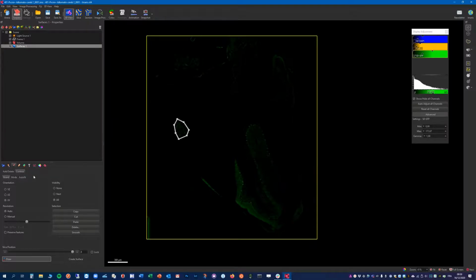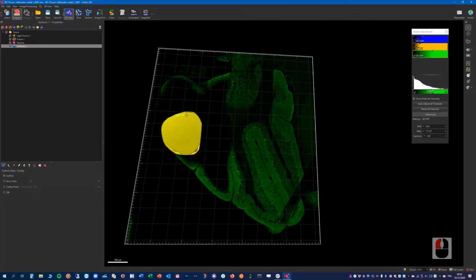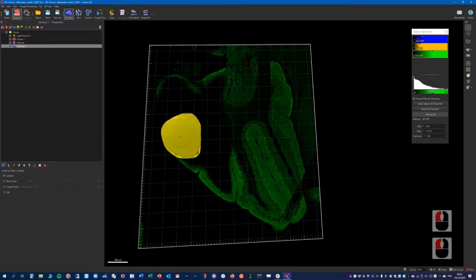Normally once it's done, we can go back here, and now we can see the region that we have created. What's nice with this is that if we go back to the edit tool, here we can see mask selection, and by doing this we can create new channels that only contain the signal from within this region.